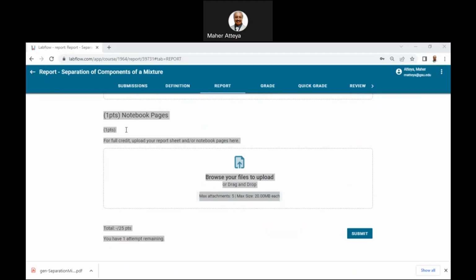So you can take this one here out and delete it, but do not delete, let it just stay. So this one here is 0.100.